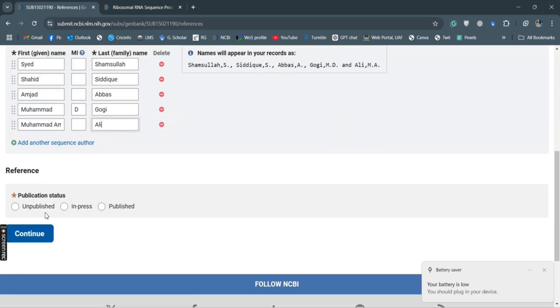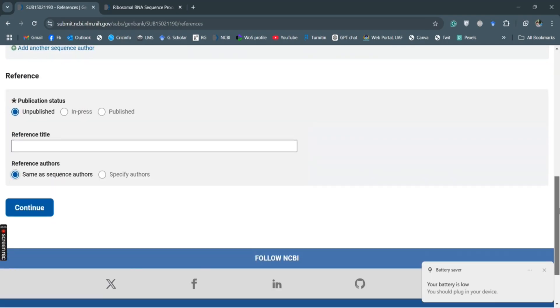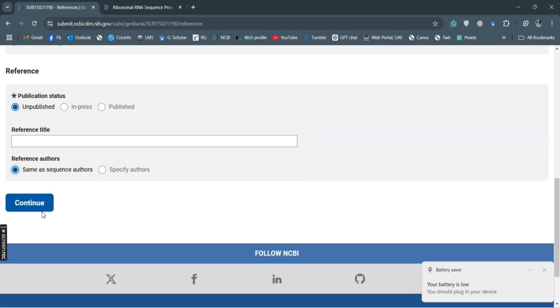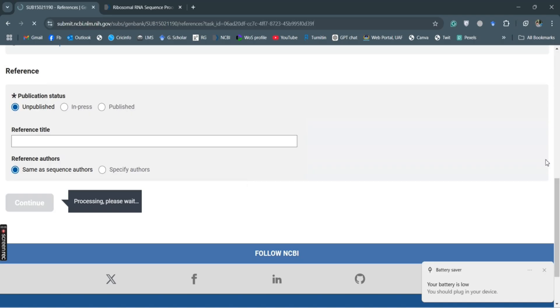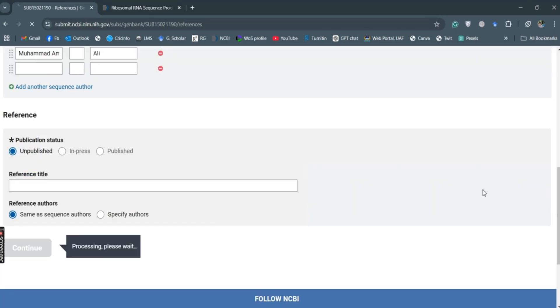This is unpublished and same as sequence authors. So we will continue it and now it will take us to the review and submit page.